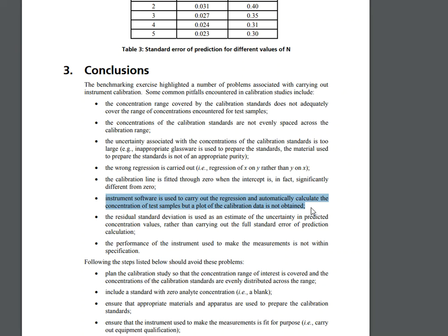Be able to go in and print off a report that shows what the signals were based on the concentrations that you made. You have to have a physical trail of this in most instances. And if you don't know how to print off that paper, if you don't know how to go into the software and set all of that up and double check the concentrations and double check the absorbances or the signals or the areas, then you're doing us no good.